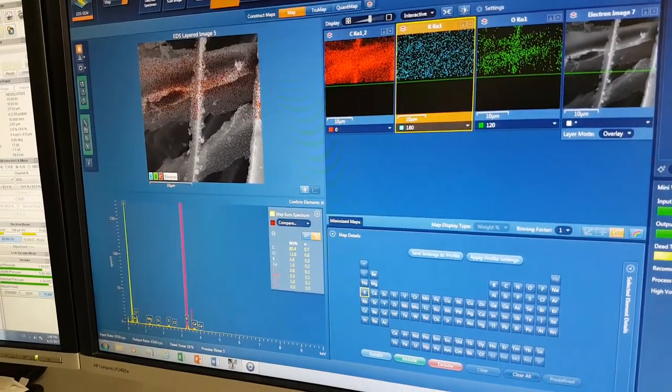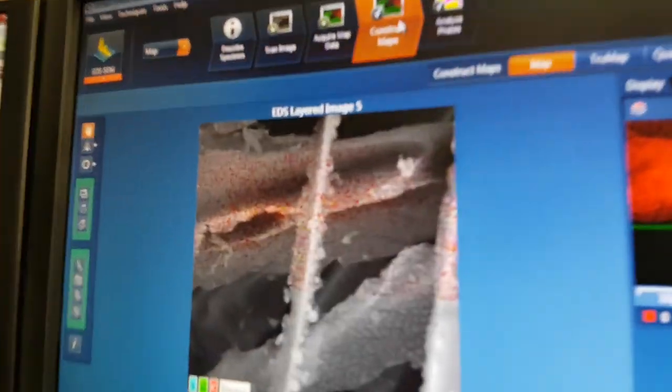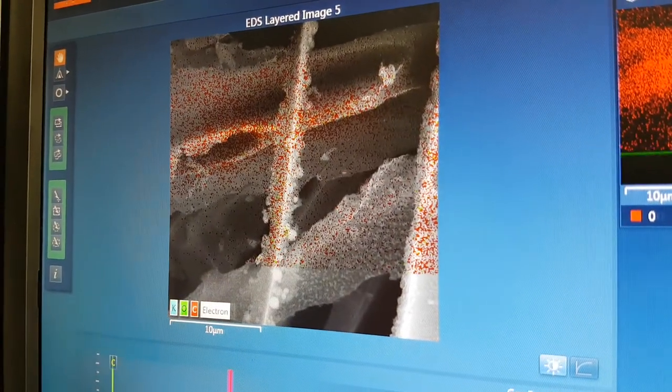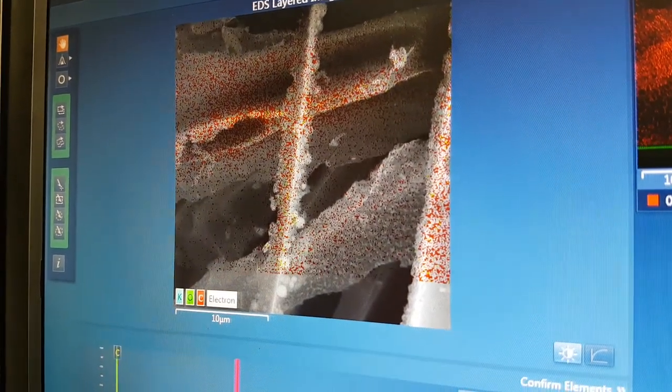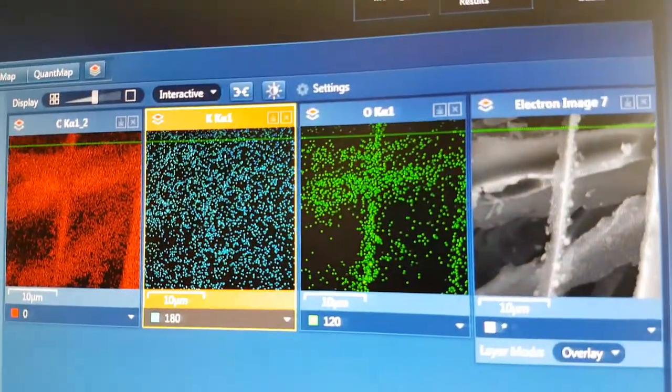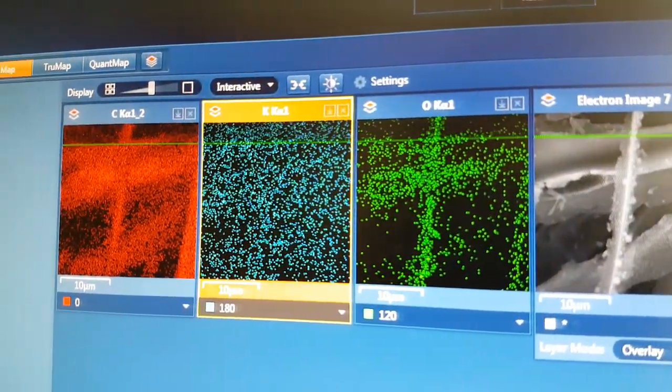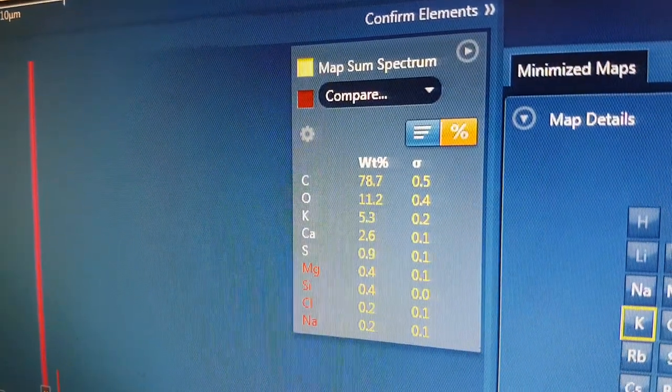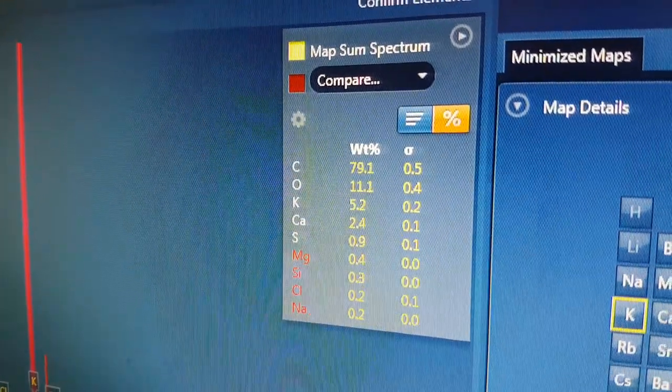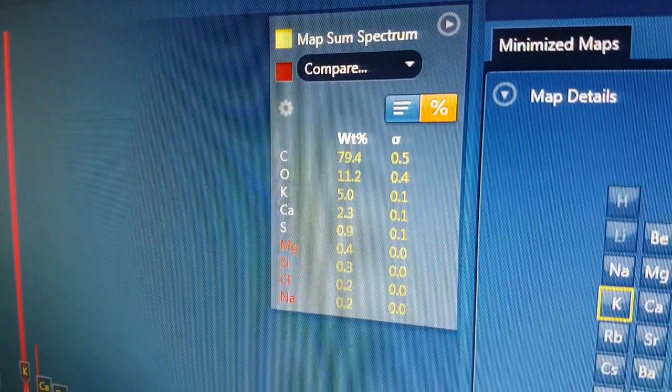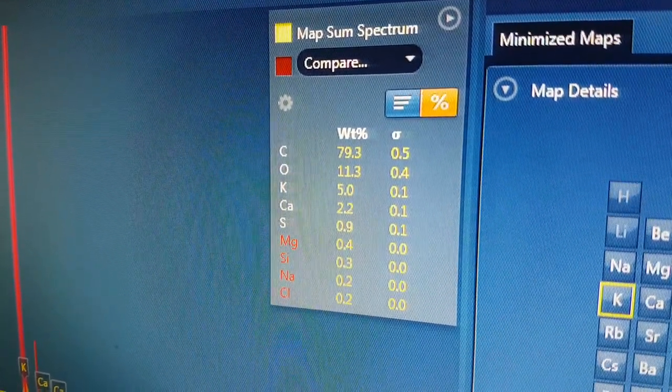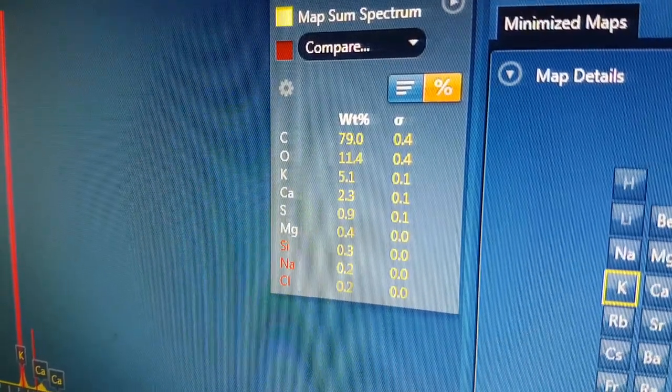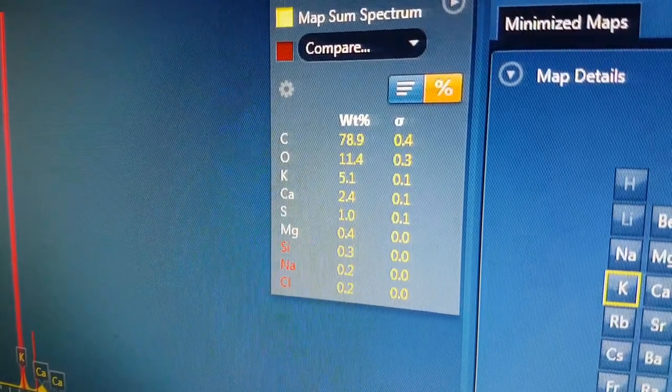Okay, so we are having a look at this little fiber that has all these little spheres on it. As you can see here. And let's see what it's seeing. So, obviously the bulk of it's carbon. And potassium, calcium, sulfur, magnesium, silicon, sodium, sodium, chlorine.